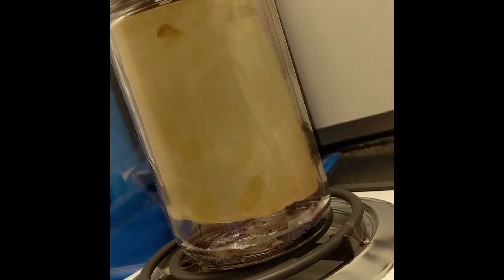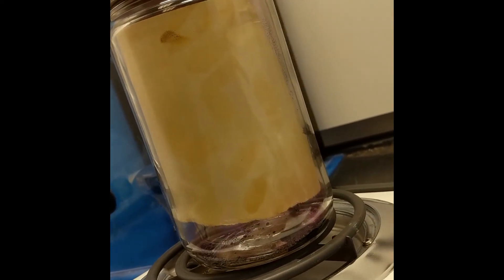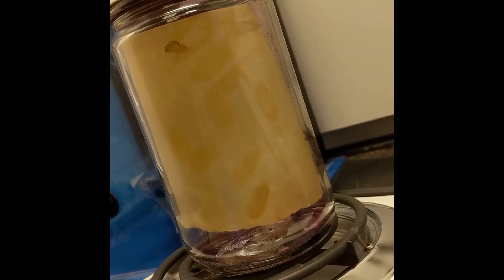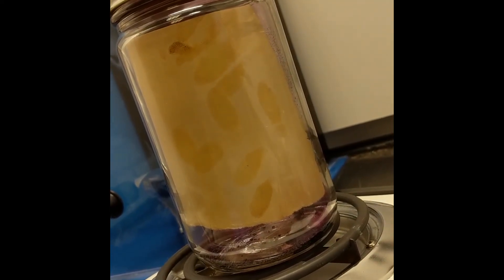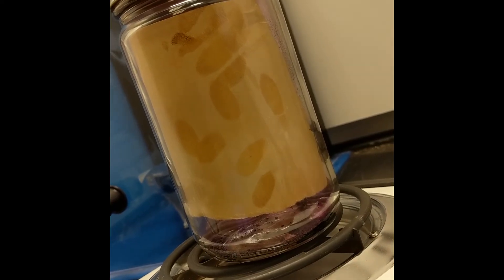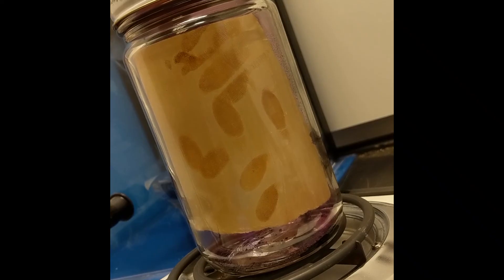This method works very well with unpainted surfaces, cardboard, or paper, as you're seeing here. The print turns a deep yellow or brown and should be photographed immediately. Another advantage of this method is that it is temporary — it does not permanently alter the evidence being tested. The iodine will eventually sublimate from the print, returning the evidence to the way it looked before iodine fuming. If the investigator does not want the print to fade, they can fix it permanently by applying a starch solution, which turns the print a deep purple or black color.